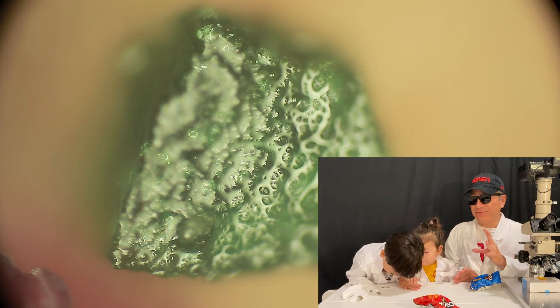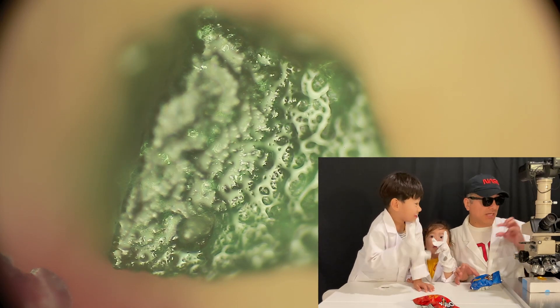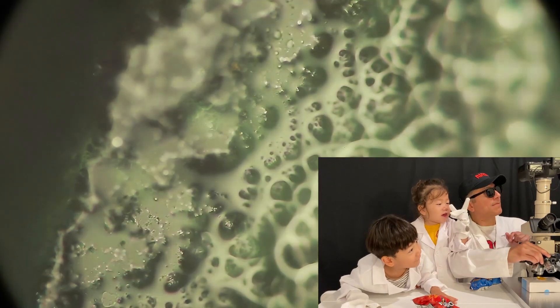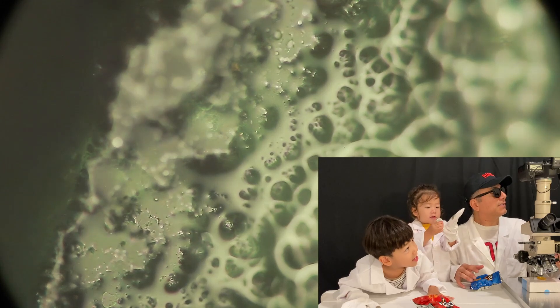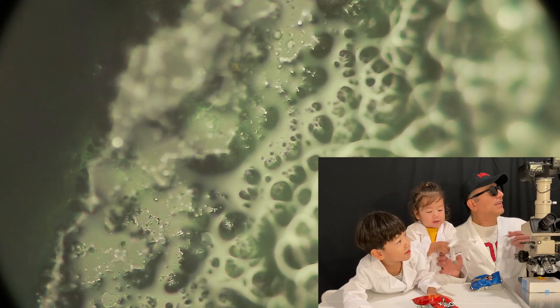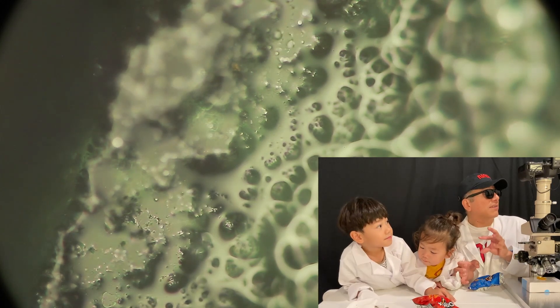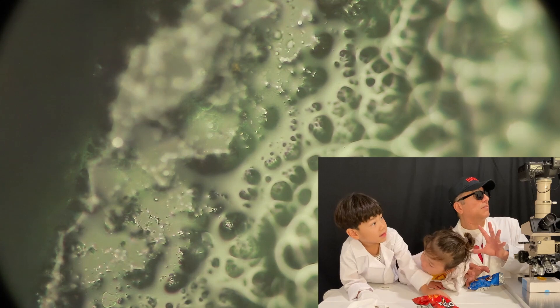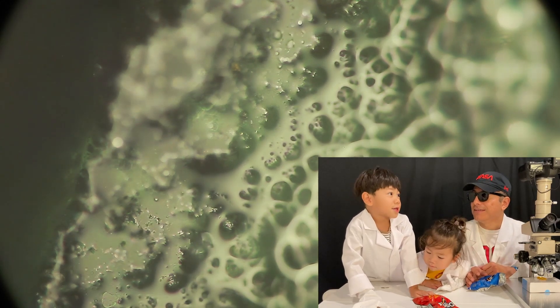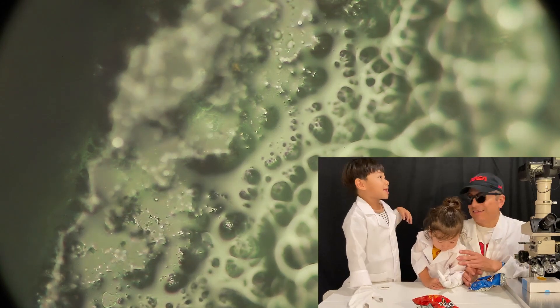Should we explore 50x and see exactly what it looks like? Okay, the final frontier — 50x. Here we go. Oh my gosh, it's even bigger. I don't even know what we're looking at. That little speckle of powder is now really up close. It's just covered with all these black and gray things.